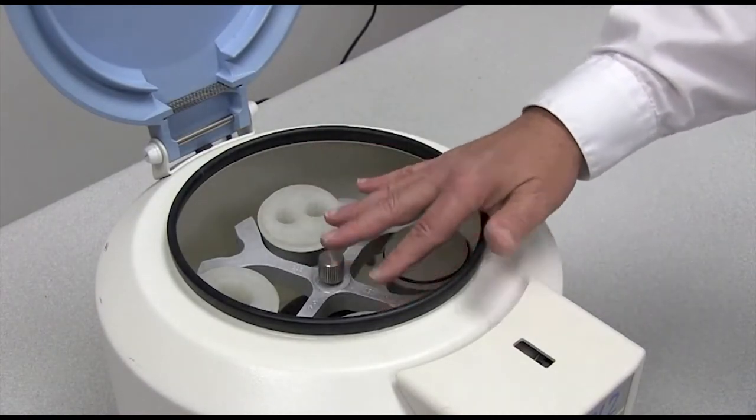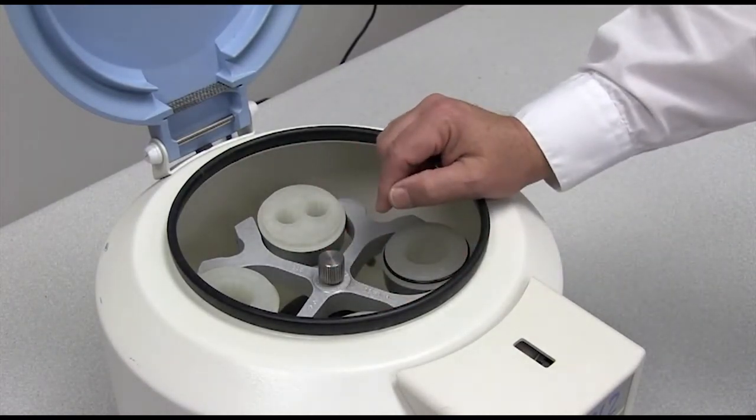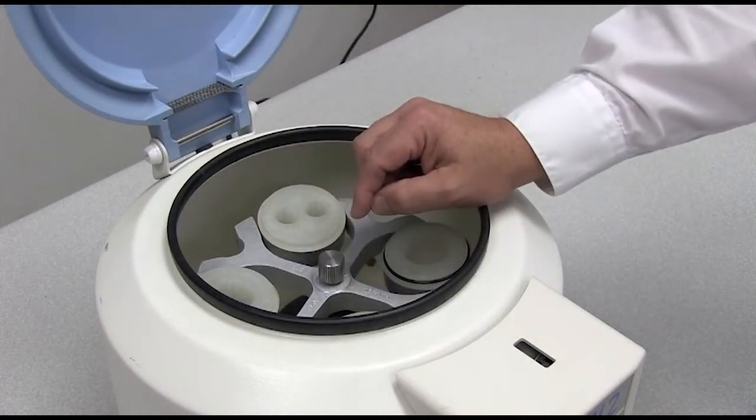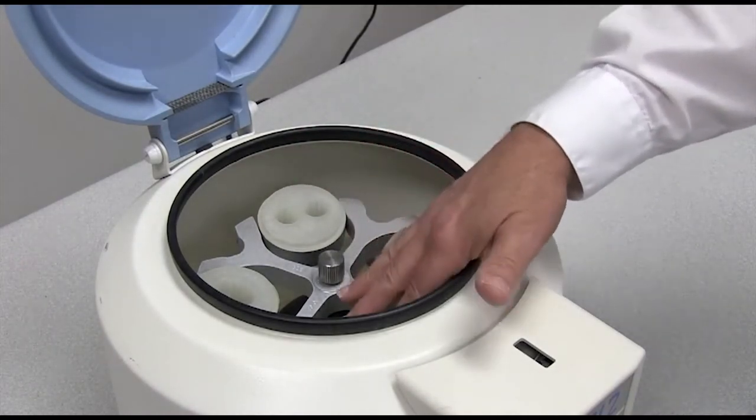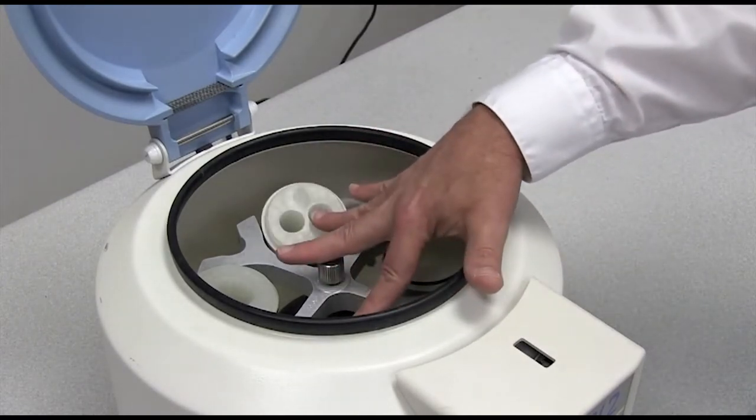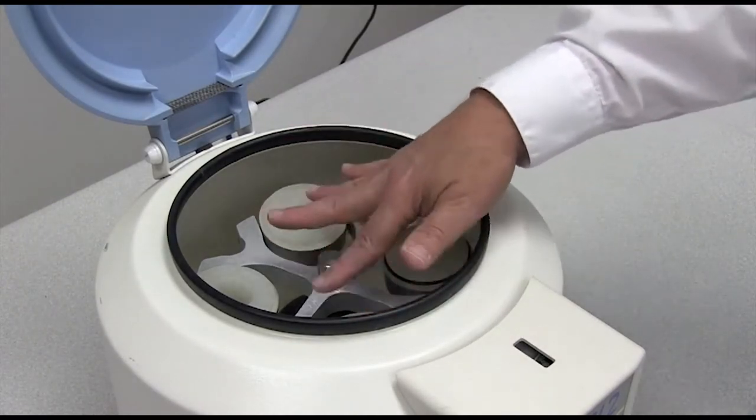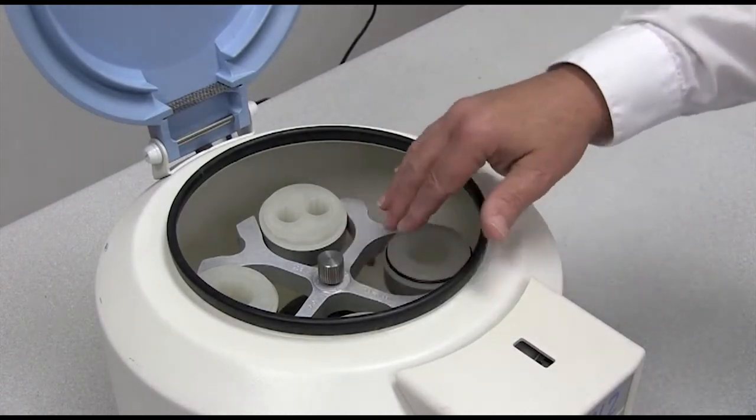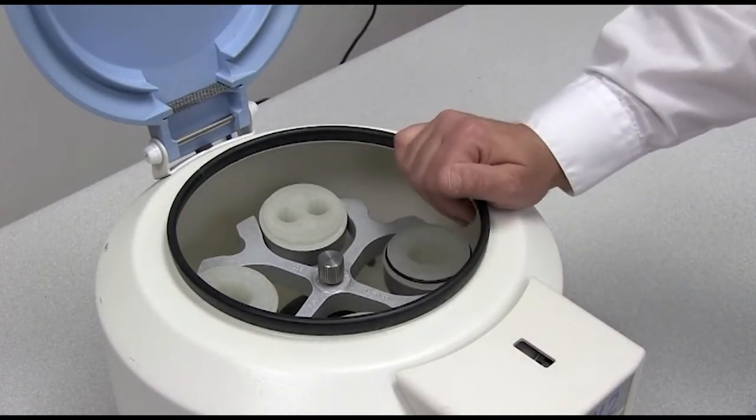So you would not want to place different size tubes or different types of carriers opposite each other, because the 15 ml carriers are meant to be balanced with 15 ml tubes and the 50 ml carriers should be matched also.